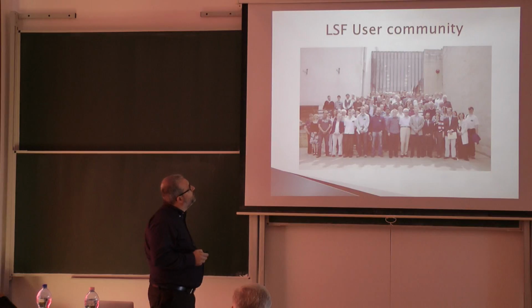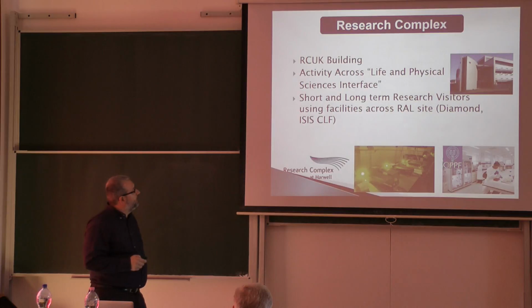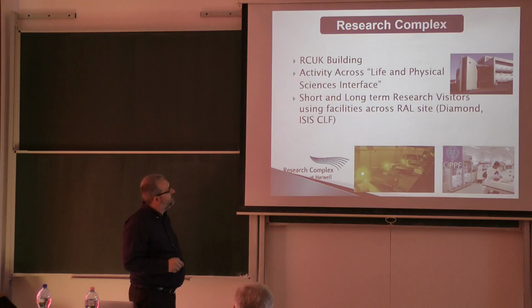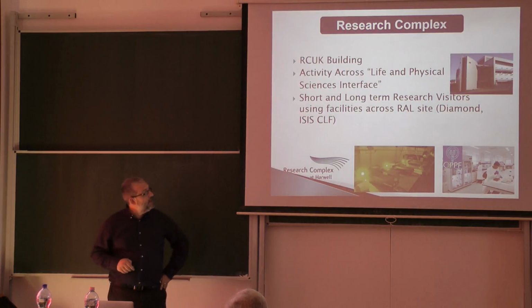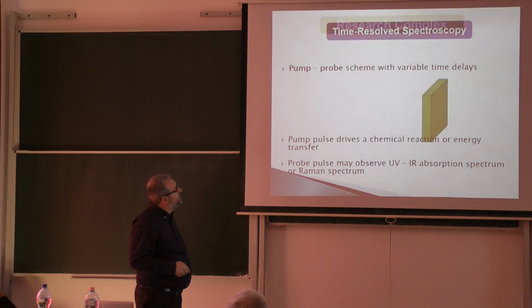So these are the people who are using these lasers as a laser facility. And this is a new building we have recently. Here we are producing the proteins for the measurements. This is the main protein purification person. And later downstairs we have the laser systems. These people are working hard on the laser system to have the proper wavelength of excitation. So we take the protein from upstairs to downstairs and we are measuring them.